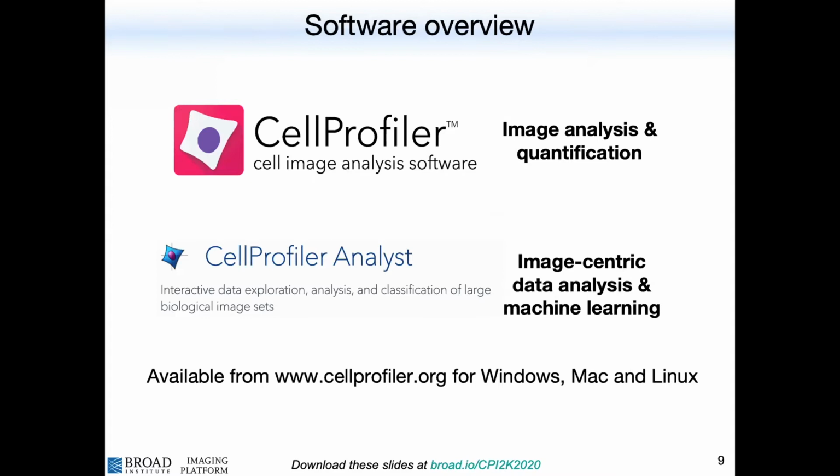So if you really want to find objects in high throughput, reproducibly, and learn a lot about them, for that, our lab has written CellProfiler and CellProfiler-Analyst for about 15 years now. These are the two halves that can be used independently, but they work best together.